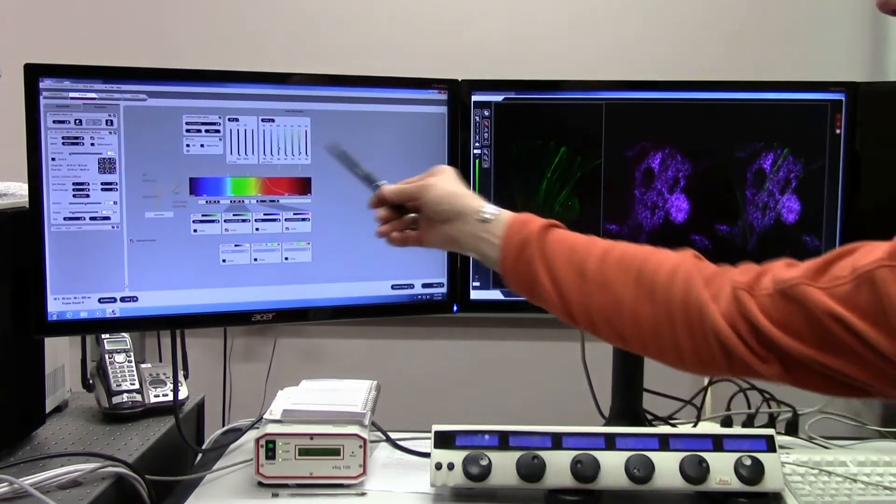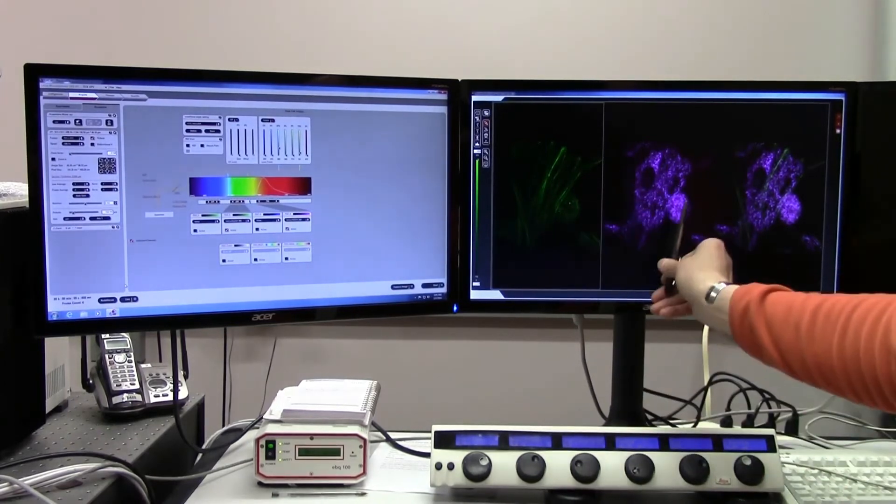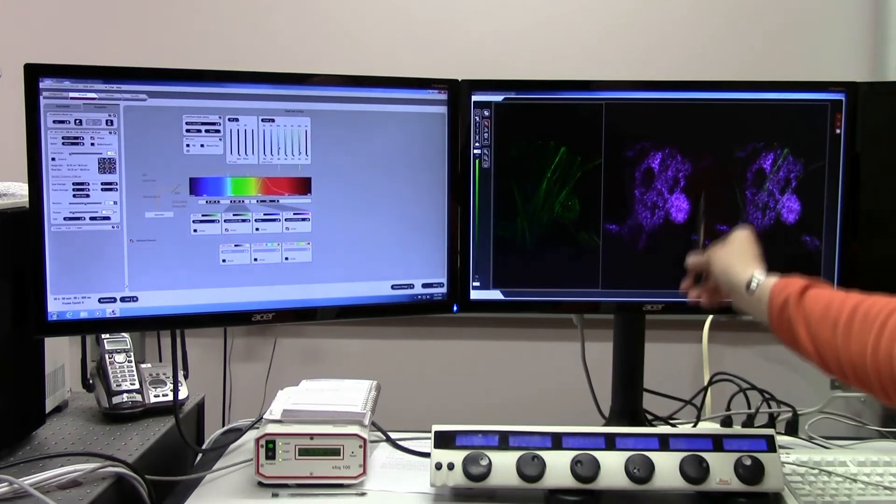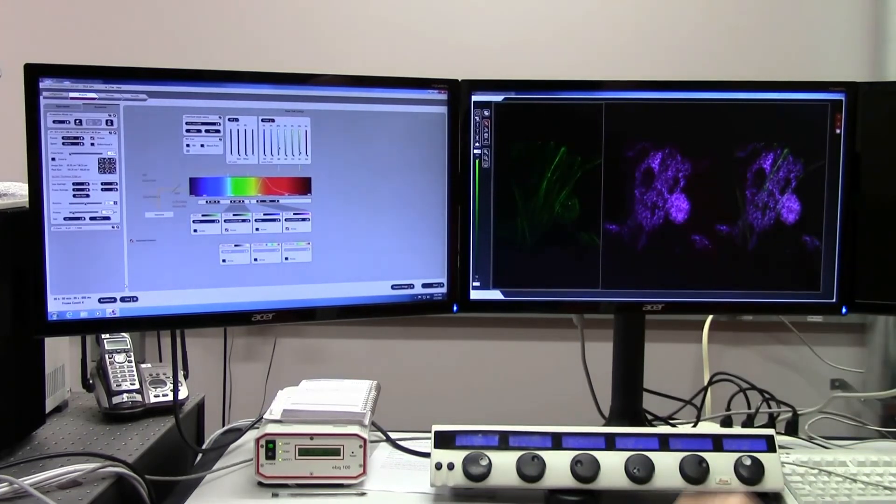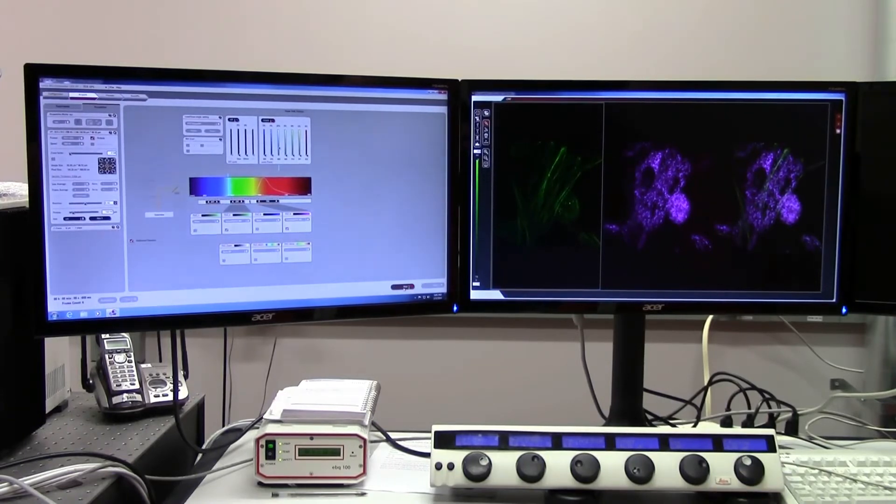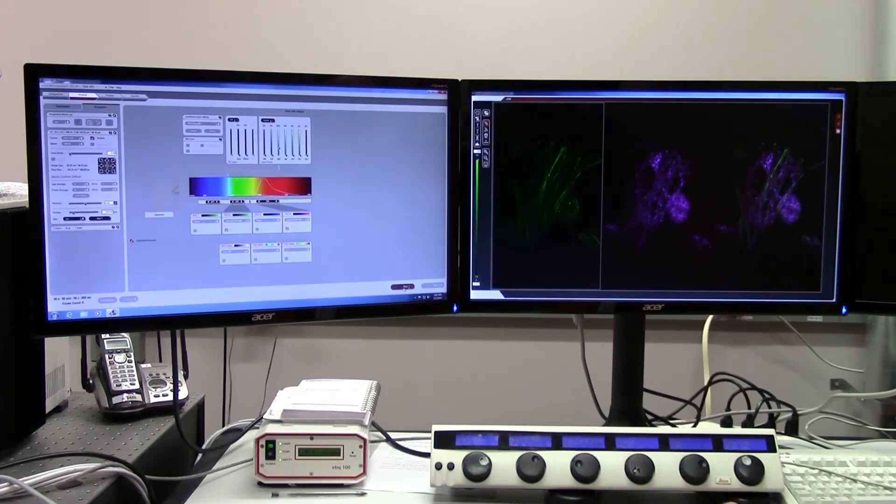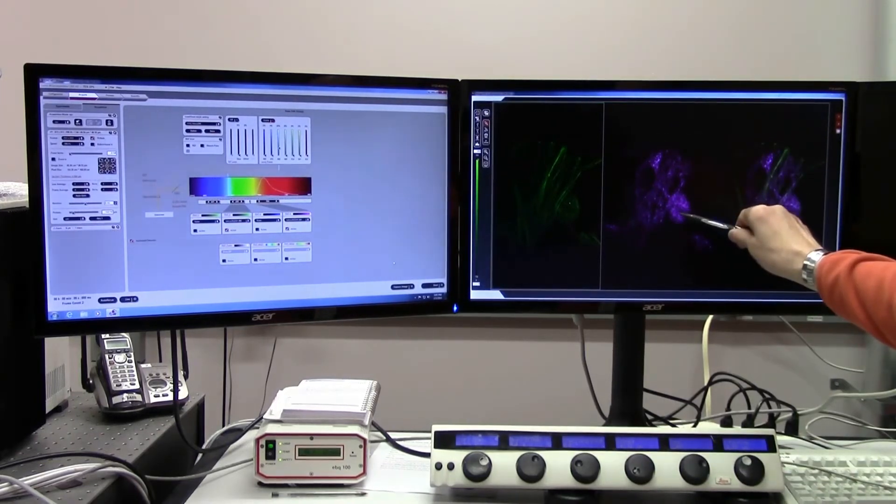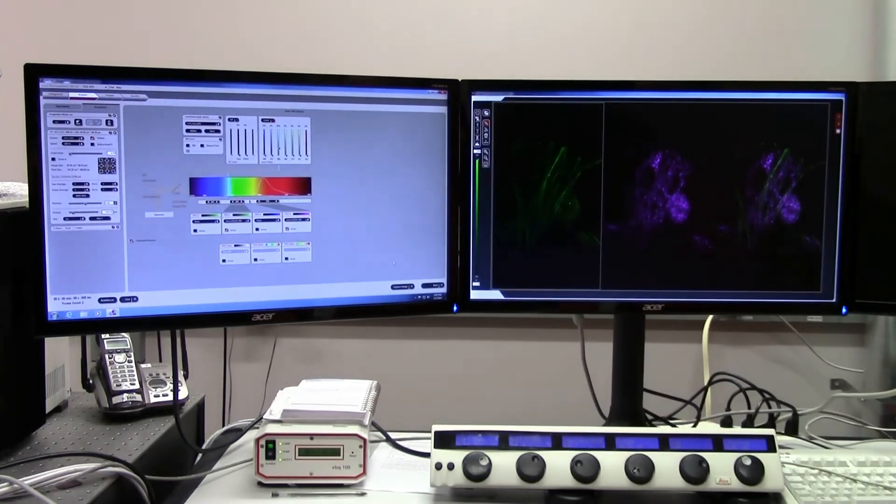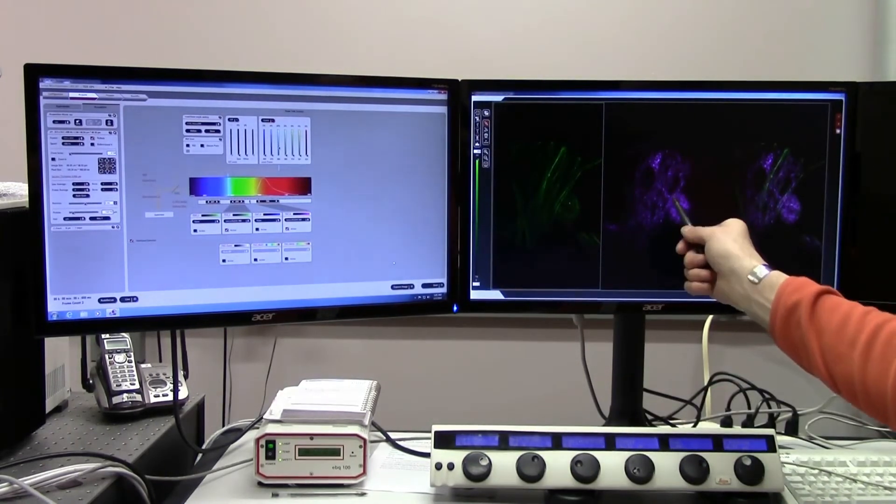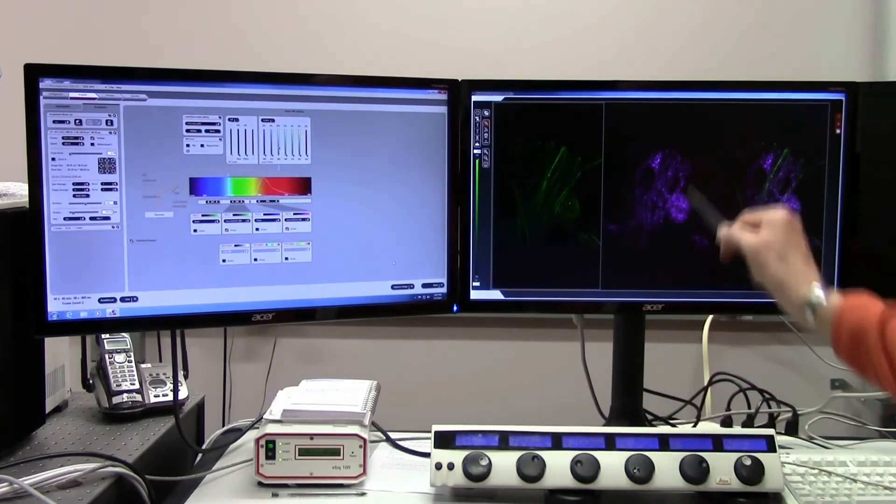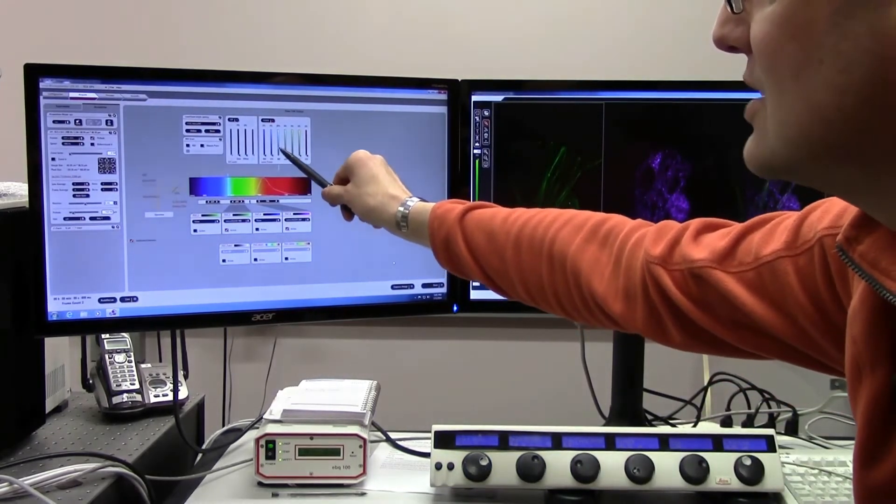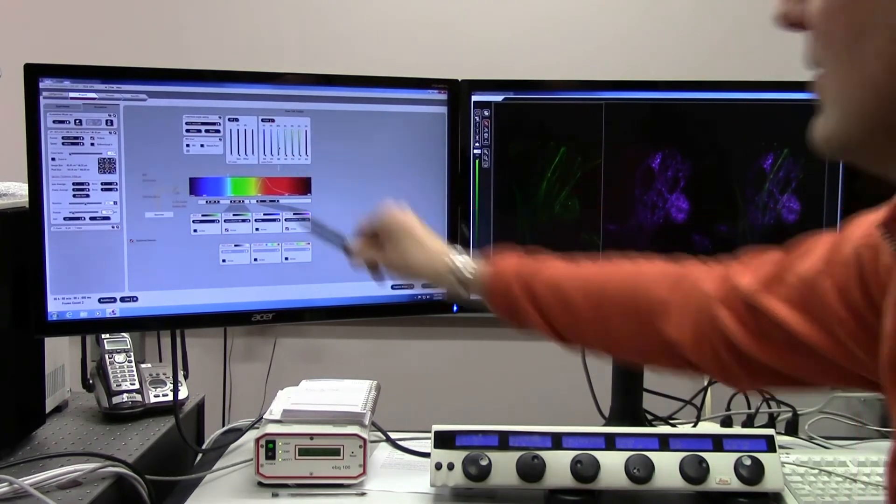So the reciprocal experiment now. We know that no green light is bleeding into the red channel. We can get an idea if the red emitted light is bleeding into the green channel, and we can do this by turning off the red laser. If we do that as capture image, we get a surprise. We're still seeing the red light with the red laser turned off, and that's because this dye is Alexa 555. If you look carefully on the spectrum of the dyes, you will see that Alexa 555 can still be excited by the 488 laser line.